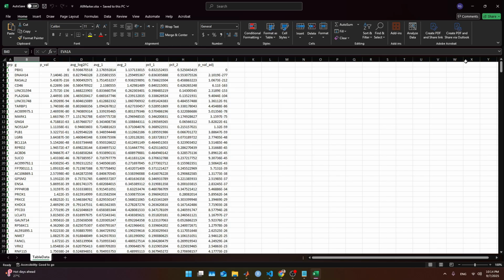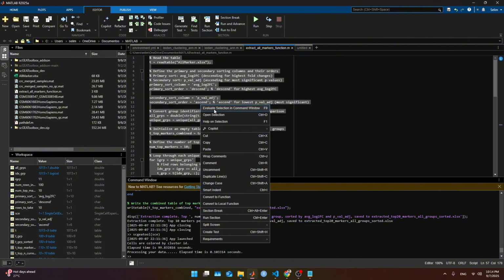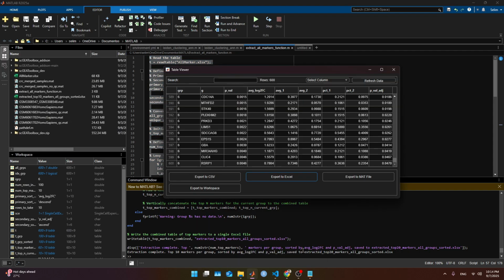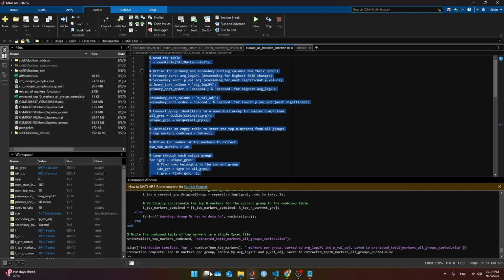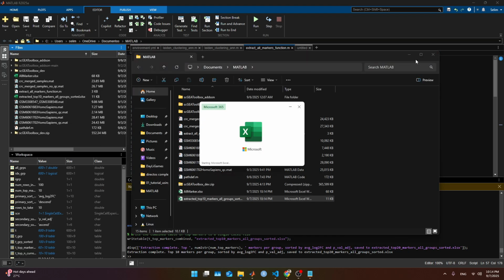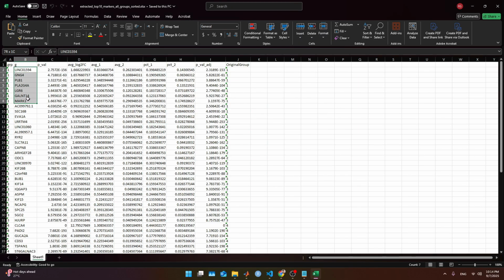Okay, our task again is gonna be simplifying that. So we are gonna run this script to extract only the top 10. Sometimes the top 10 is not enough, and we look for the top 20. Now I'm gonna close that one, and I'm gonna open the top 10 extract. And here I'm gonna look at the first set.